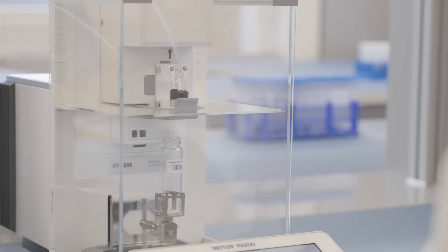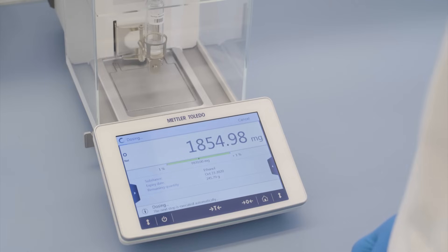The liquid dispensing module automatically dispenses the solvent directly into the target container. Very small quantities can be prepared so less material is required.